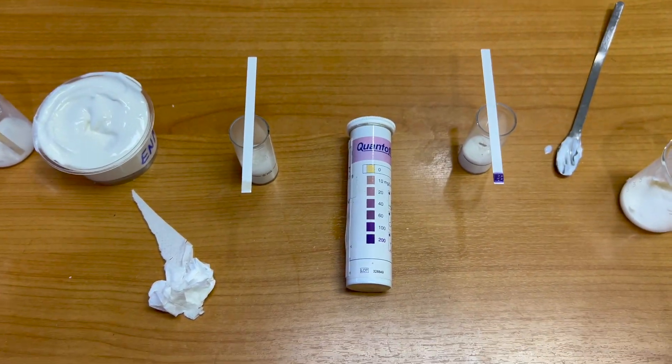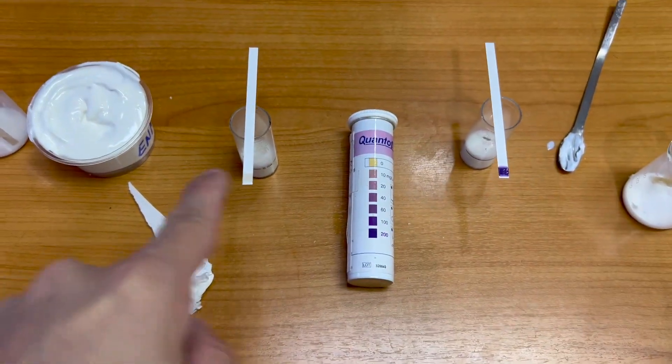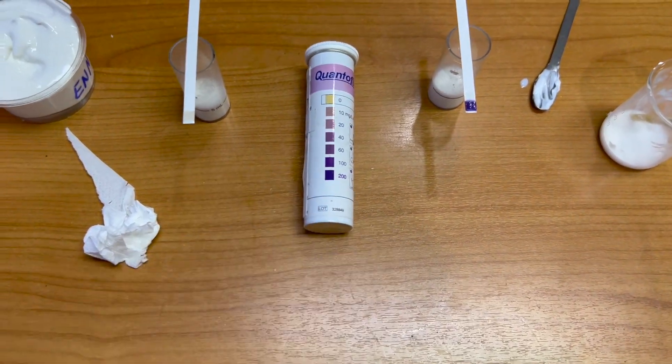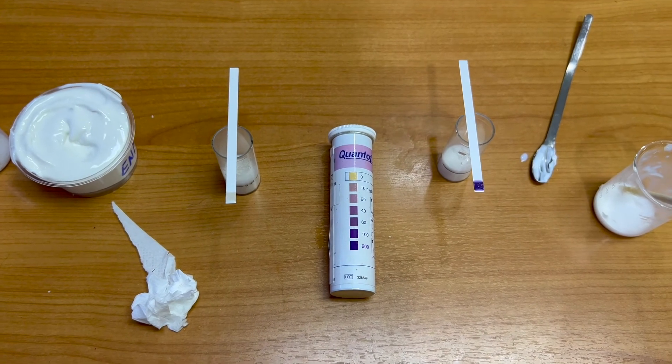The sample with no formaldehyde should not show any color. But the sample with formaldehyde will become purple. This is our test method.